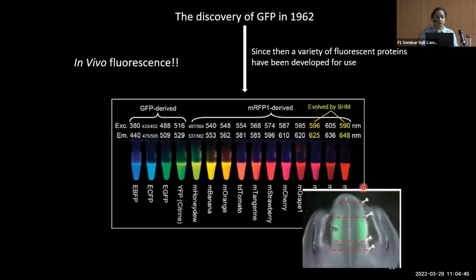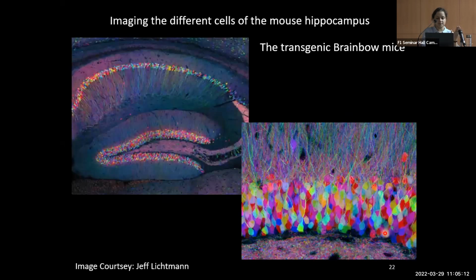Okay. So before finishing, I'll just show you 2 more slides. This is an example of our data in the lab, where we actually made that mouse which has only GFP expressing cells in the thalamus region. And this shows a real-time image of the cells of the thalamic brain tissue where nothing else is stained, only the GFP fluorescence is visible. And we have used no immunofluorescence on this.